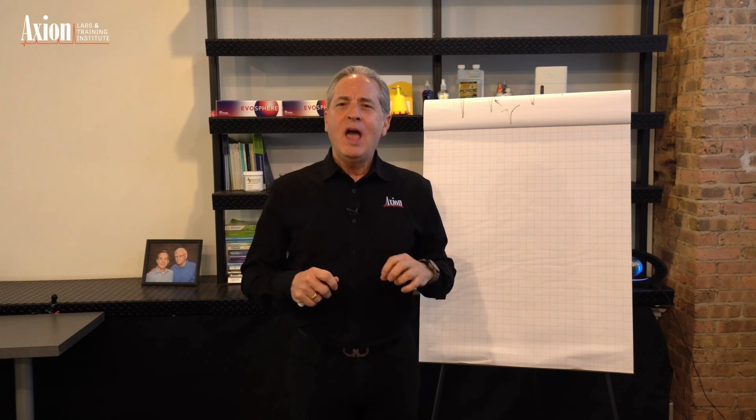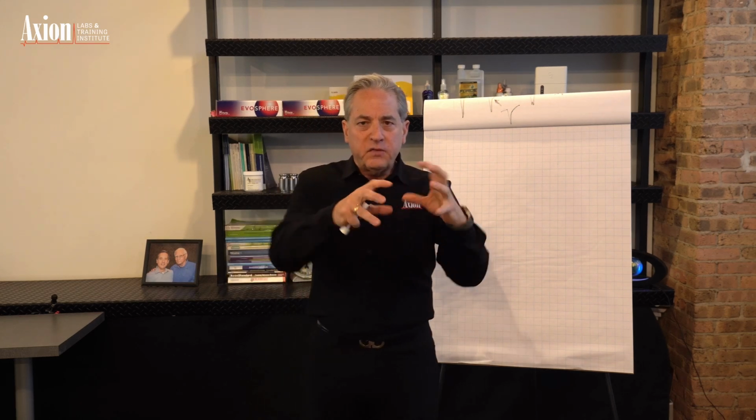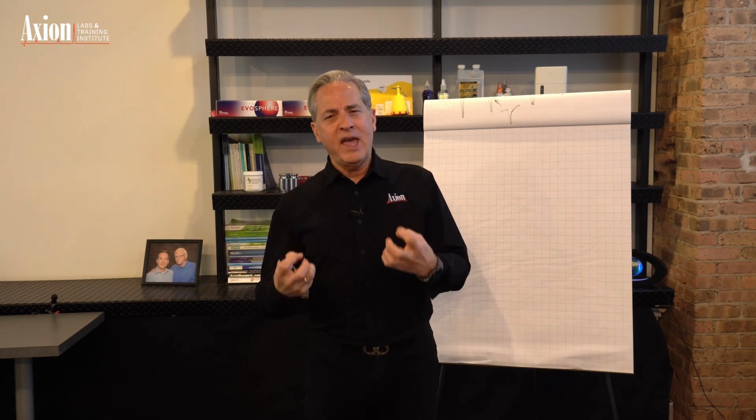You look at the surface, and the surface on the outside is a small fraction, small percentage of what's inside that particle. I think of LC particles like Nerf balls. It's a little sphere, lots and lots of nooks and crannies, so most of the surface, 95% of the surface area is inside the particle. Why is that important? Surface area is where we do the separation, it's where we hold on to the analytes, so we like to have lots of surface area.